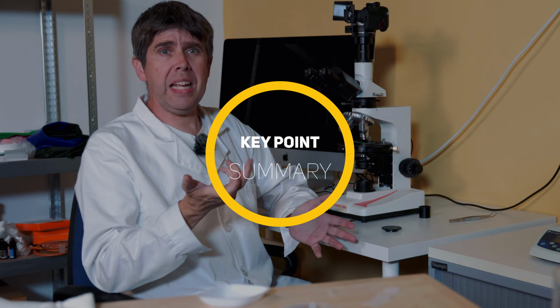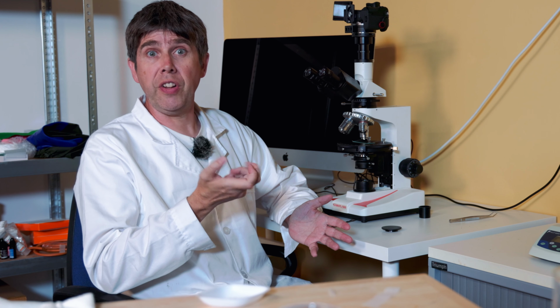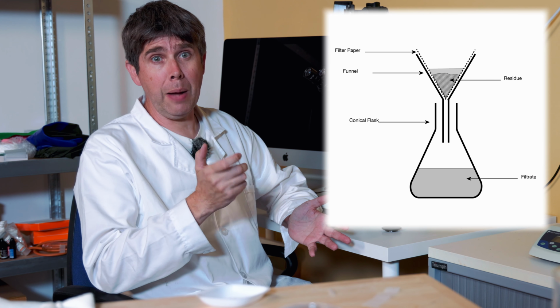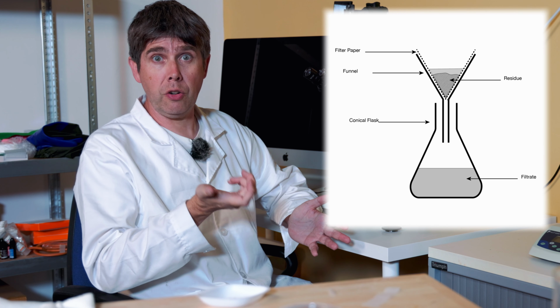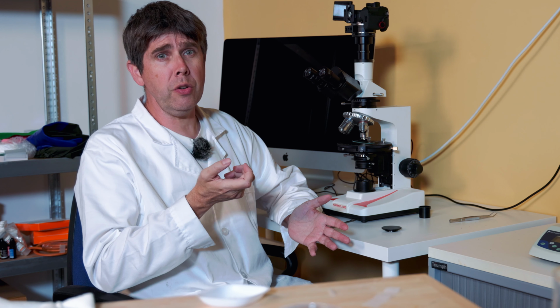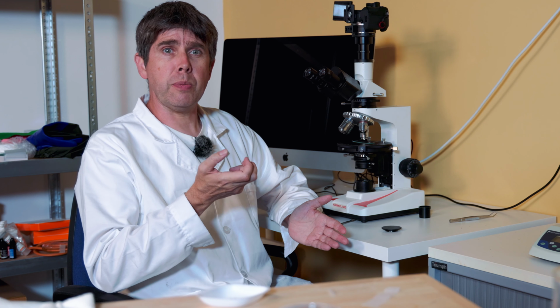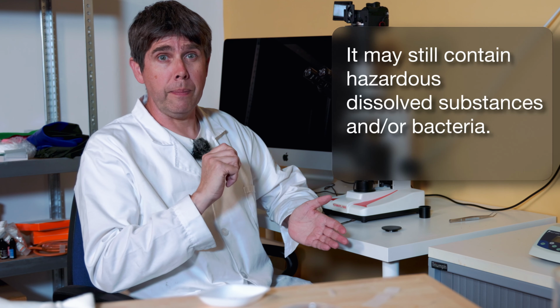So, in summary, you should know a few examples of ways in which filtration is used. You should be able to draw and name the apparatus needed for filtration in the lab and use the key terms mixture, residue and filtrate correctly. You should be able to explain why we cannot use filtration to separate a dissolved substance from a solution and why water that has passed through a filter paper is not necessarily safe to drink.